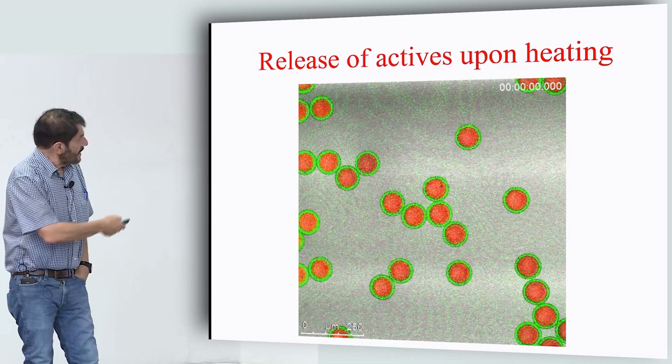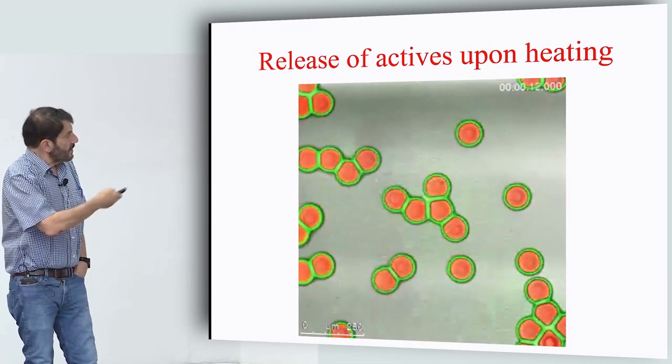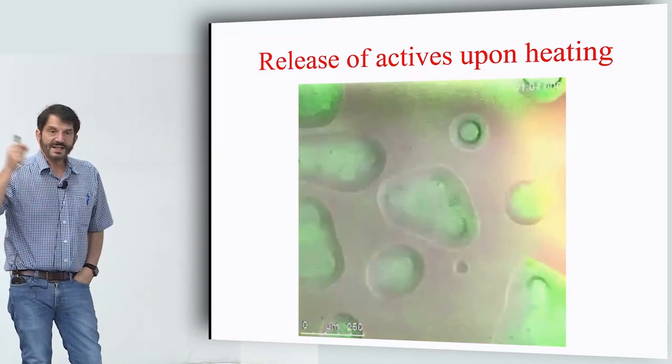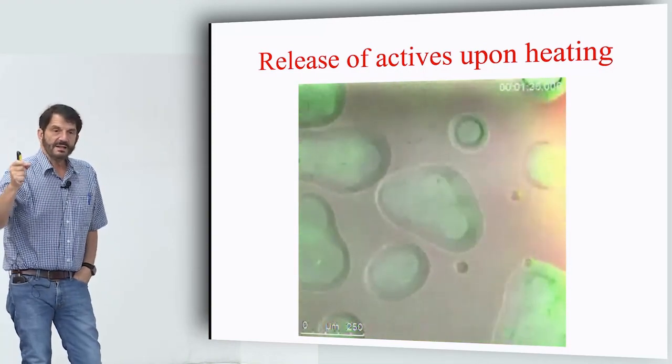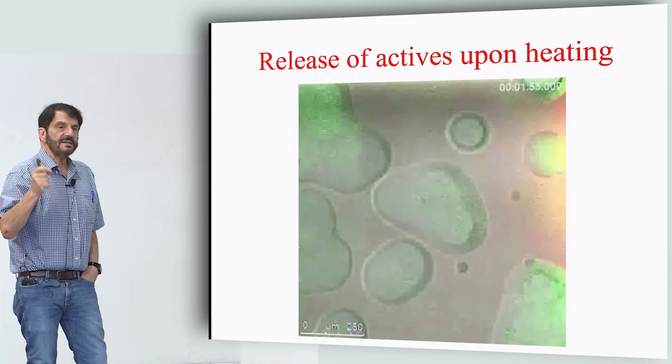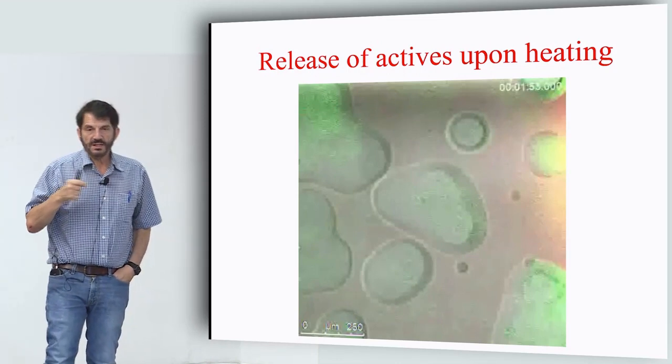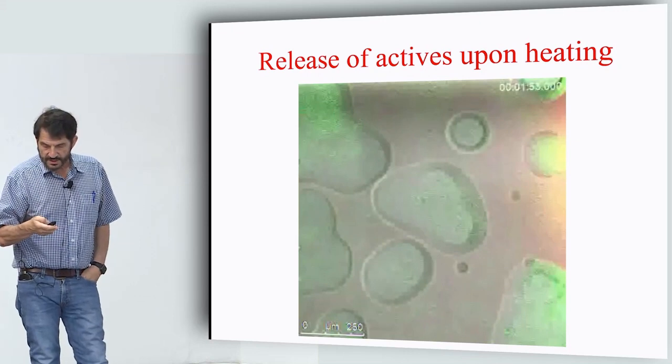And if you do this, if you watch this, here we've just used a red and green dye, but you can see they're released at exactly the same time at exactly the same point. So you can precisely control the relative concentration of the drugs in addition to delivering the drugs to the same location.